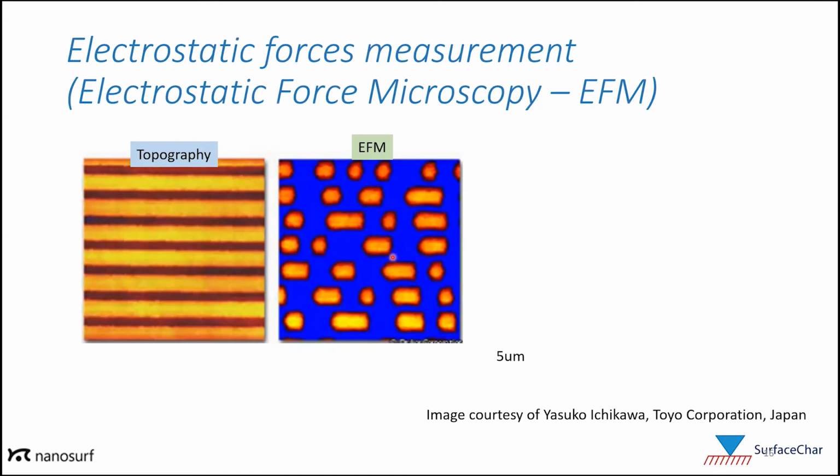The final electrical method I will survey is electrostatic force microscopy, or EFM. This method maps the effect of long-range electrostatic force gradients on an oscillating cantilever and is useful for applications such as electrical failure analysis, measuring charge distribution, and detection of trapped charge.